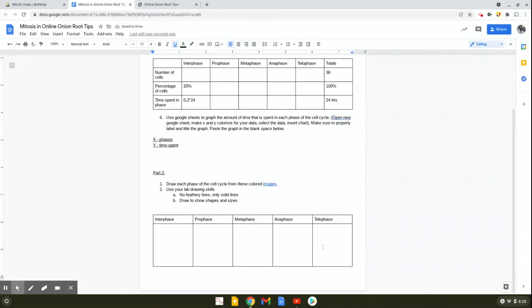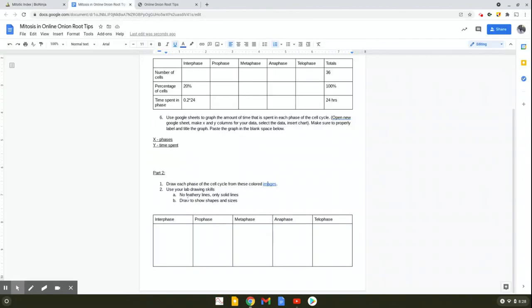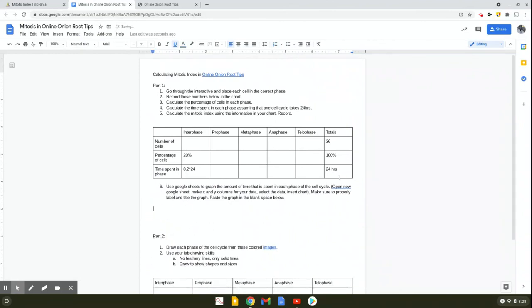And then this here, I know you can't draw on the computer. If you can, that's cool. But if not, you can upload a picture. So this is actually the same thing that we looked at here. I want you to draw these pictures and then upload that also along with this assignment, okay? If you have any questions on this graphing, let me know and I will help you out with that.